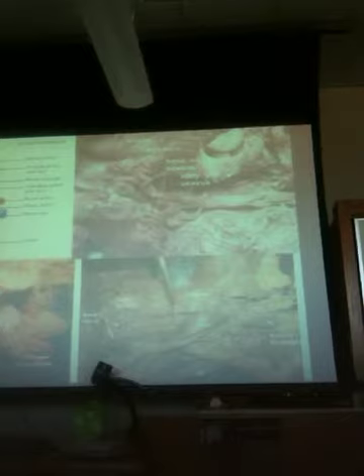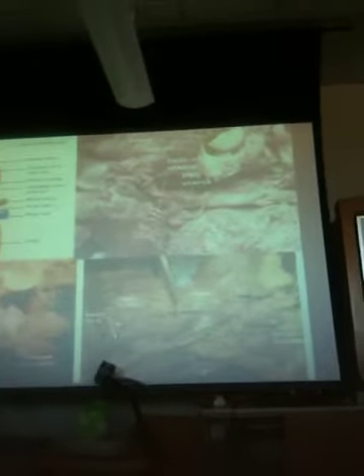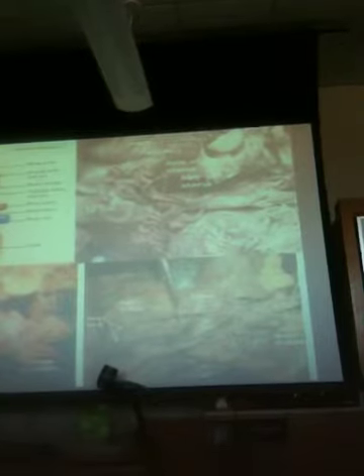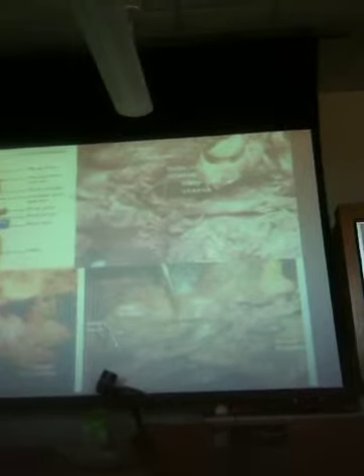So this is called the uterine horn. There's one on each side. The embryos develop all along the uterine horns. And then up here at the very top, there's that little lentil bean-sized ovary. They have a very short fallopian tube. You almost can't even notice the fallopian tube. It's so small.